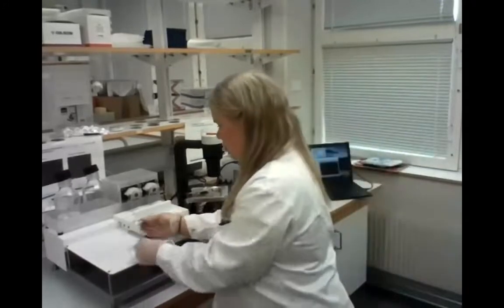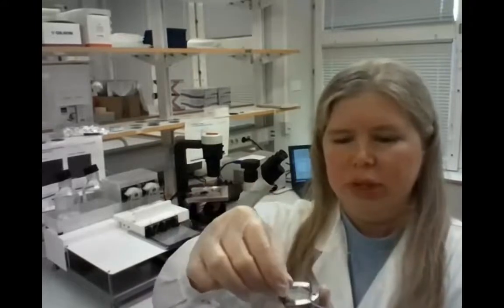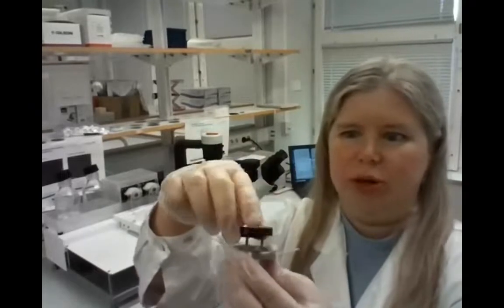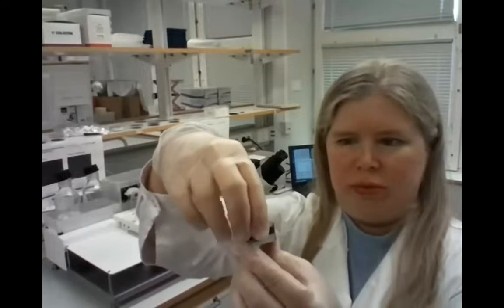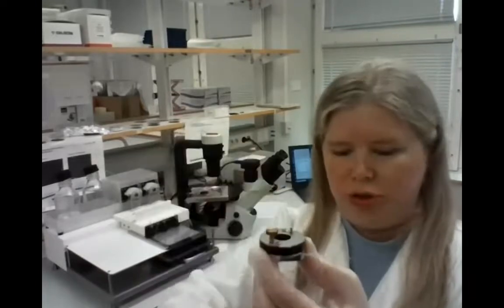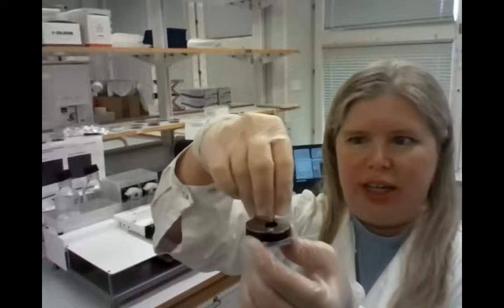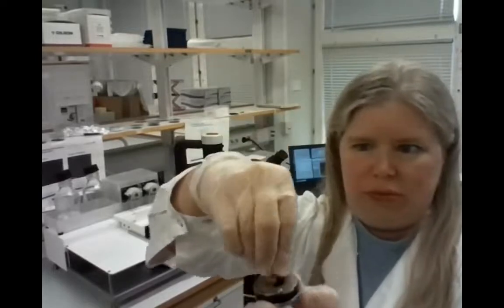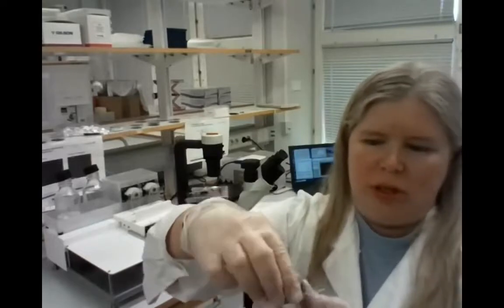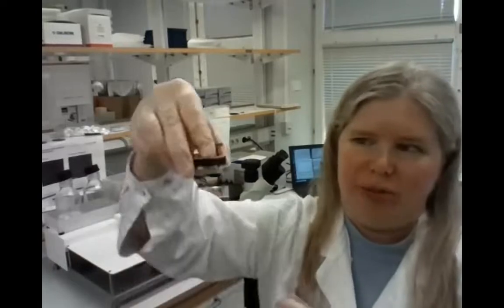So now I will put this in place in its little holder. So we have a little holder here. And this holder will also be heated to 37 degrees when we place it at the spot of dissolution. It means that everything will be body temperature. Secure this with 2 screws. And as I said, the tubes here are inlet and outlet of the perfusate. And the particles, as you remember, pointing upwards on the glass cover slip. The mucus is applied on this membrane, which will be put like this.